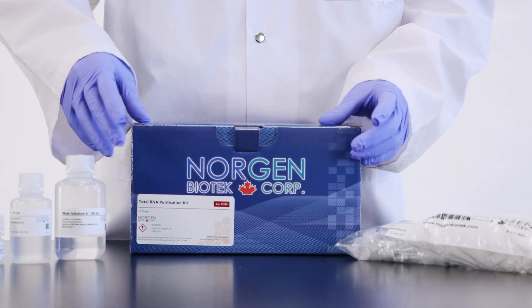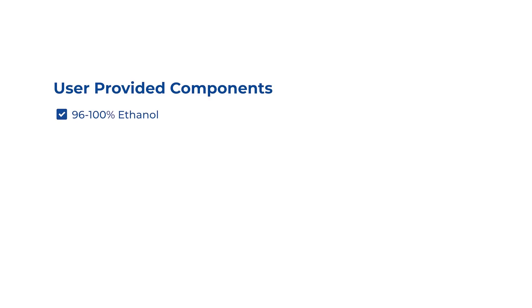And you as the user will need to provide 96-100% ethanol and RNase-free microcentrifuge tubes for processing all acceptable sample types, 70% ethanol, mortar and pestle, and liquid nitrogen for processing animal tissue.